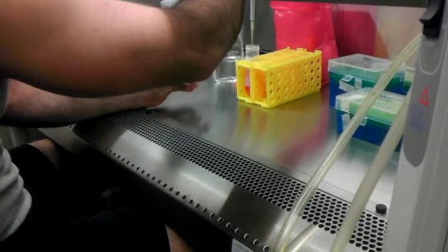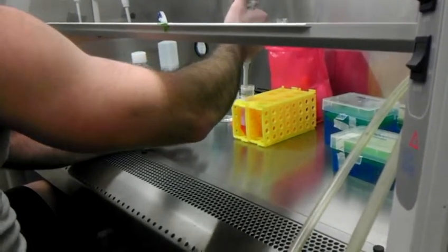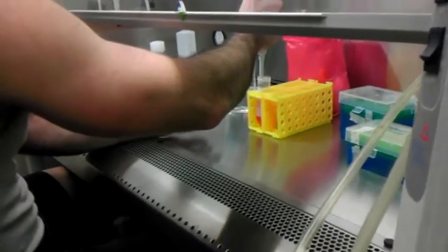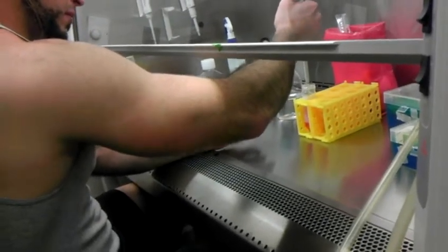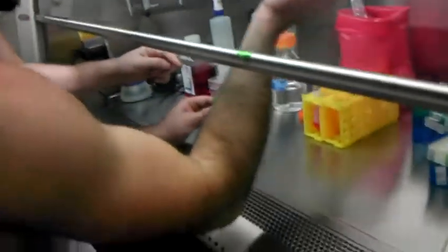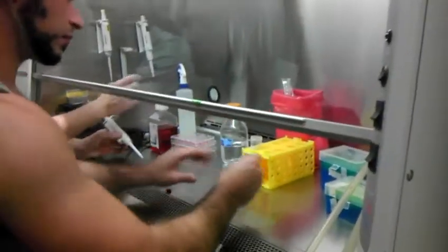Now push the button down to the first click, and then pipette up and down a couple times, inside the media. Cool. Now we're going to have to clean this out real quick, so jettison that into the waste. Close up the luciferase. Yeah, let me see this. Pull the guy off. Let me see some chem lights.